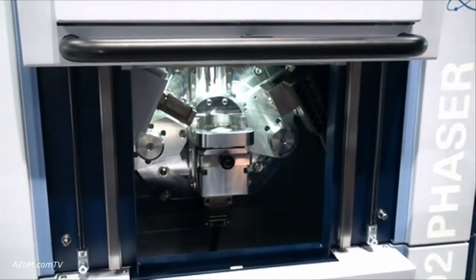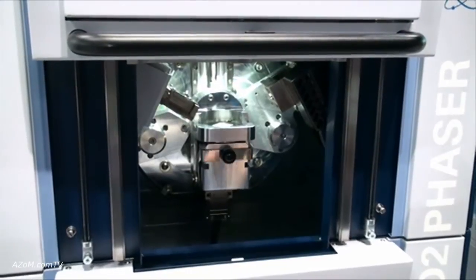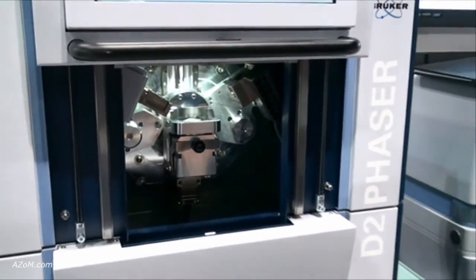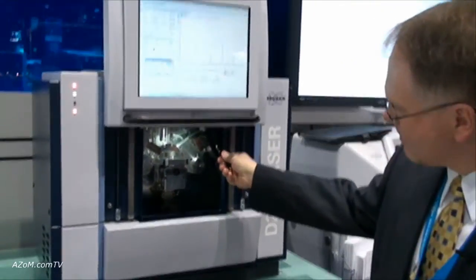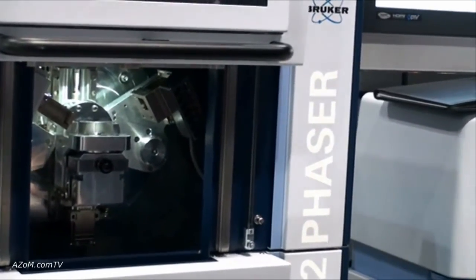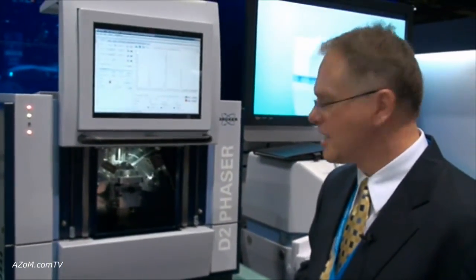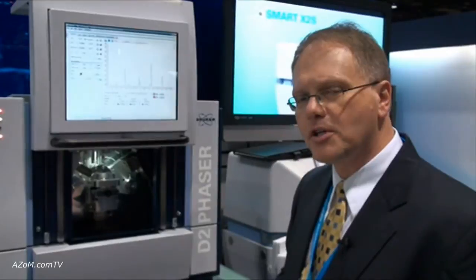Unique to this new D2 Phaser is that we have two detector choices — a first for benchtop XRD systems. A standard scintillation detector and our high-performance one-dimensional LYNXEYE linear silicon strip XRD detector. This is a 192-channel detector capable of measuring up to 5.5 degrees 2-theta simultaneously. It can operate in several modes: point detector mode, fixed mode, and scanning mode.